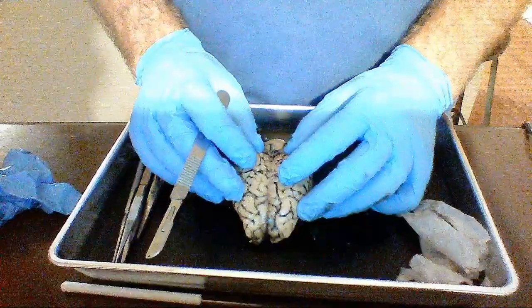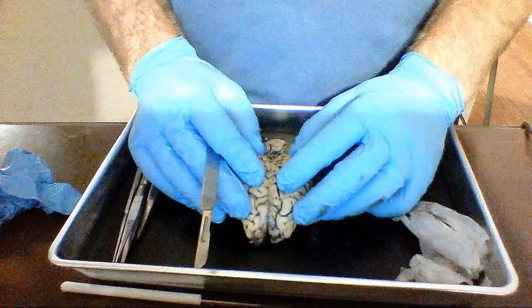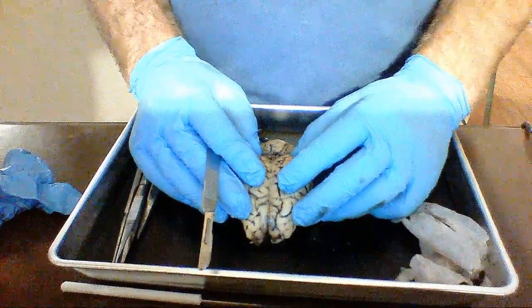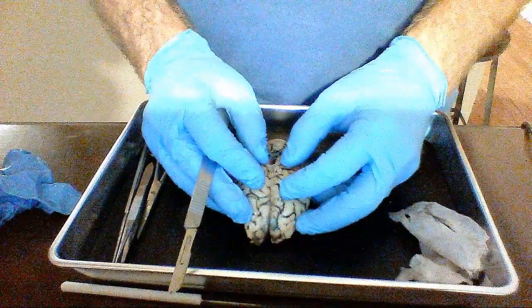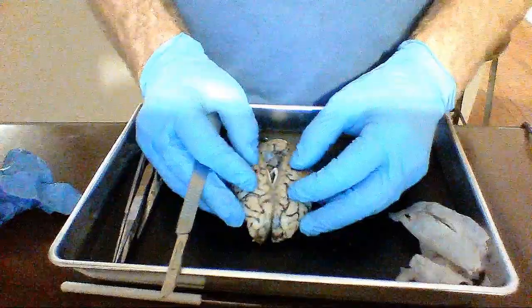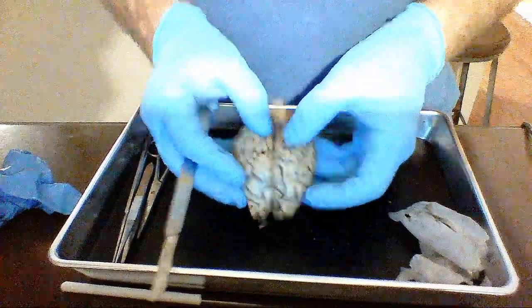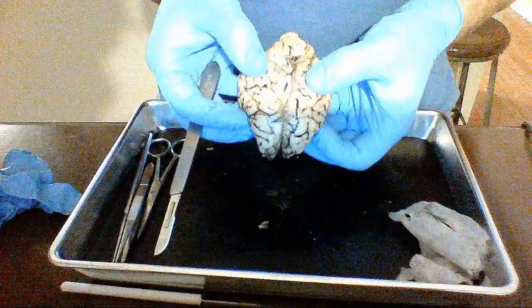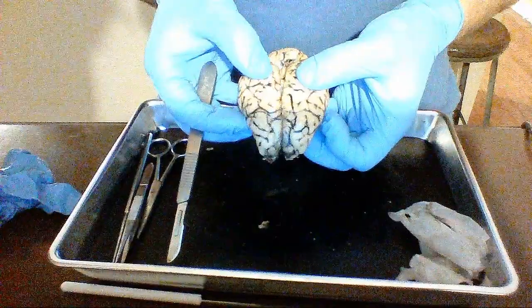Let's see. Trying to pull it apart. Doesn't come. There we go, we're starting to pull. Keep going. So you can see that white connection point that we just ripped that connects the two hemispheres. That's the only part that goes between the two. That's called the corpus callosum.